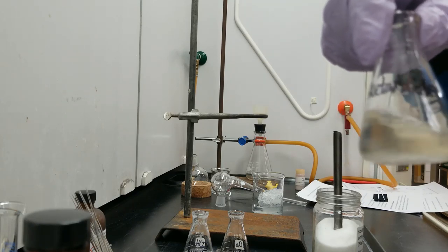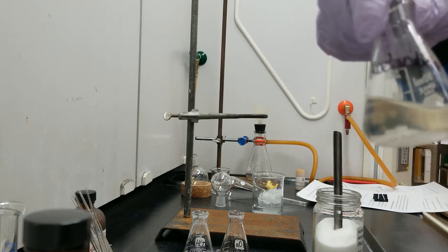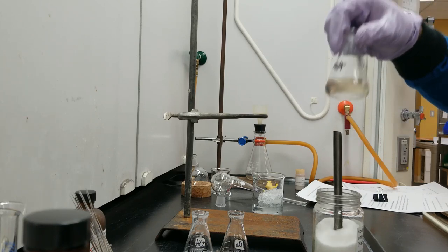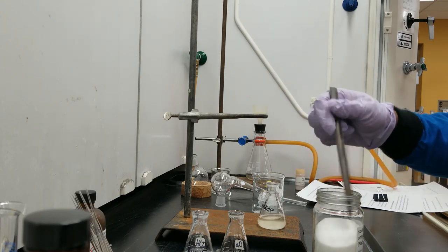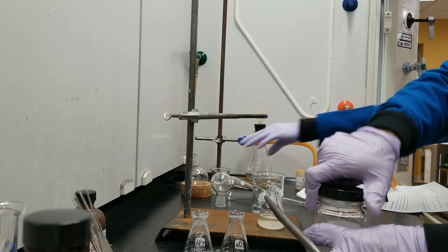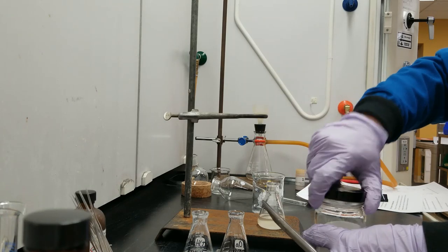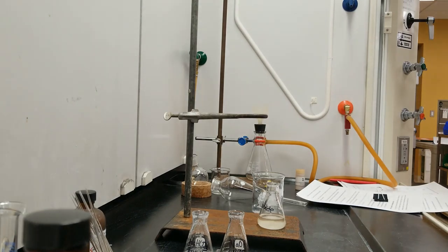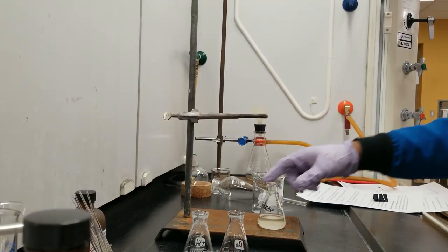So we will stop adding sodium sulfate at this point, but always make sure that you're adding sodium sulfate to the point when you see the solid free flowing in the flask. So I'll keep that aside.